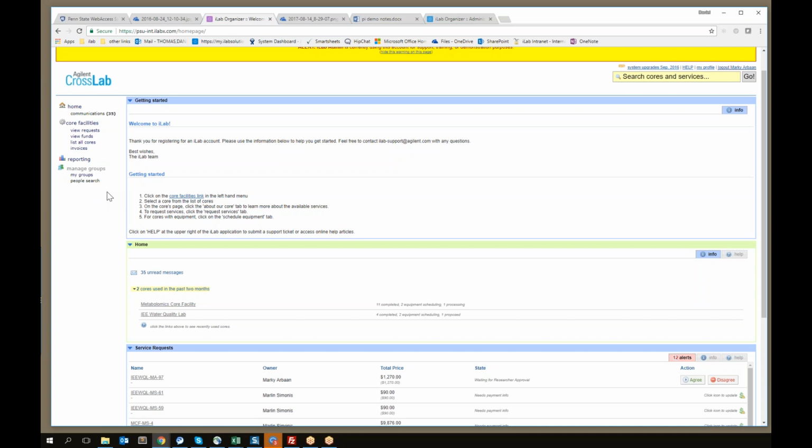And this is an area that allows you to find your way to different important areas in the system that you'll need to interact with. I'm going to talk about them one by one, and we'll work our way down in terms of what they are. Then we'll start at the bottom and discuss them one at a time, working our way back up. So your home screen is where we are right now, and you can quickly access those communications that I talked about and go directly to them through this navigation screen as well.